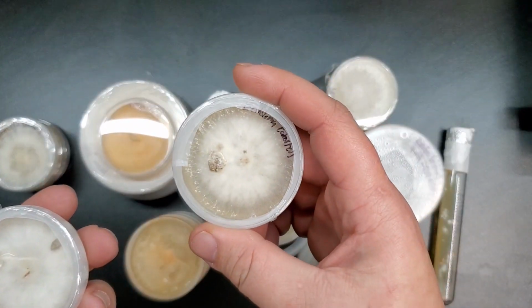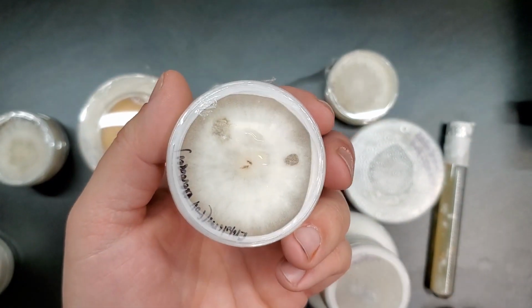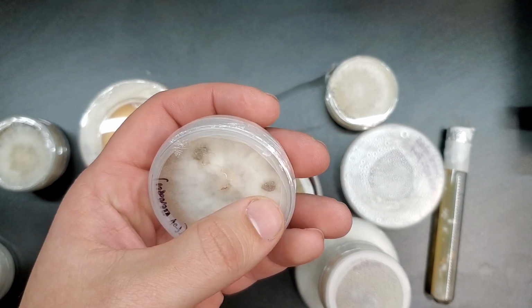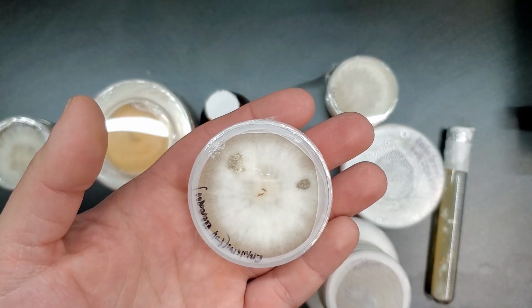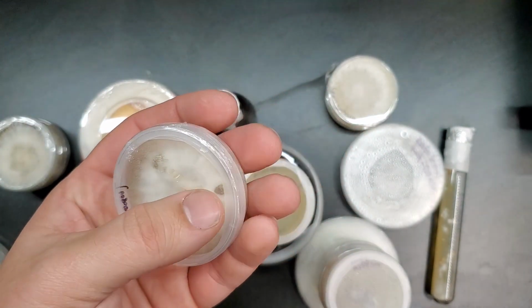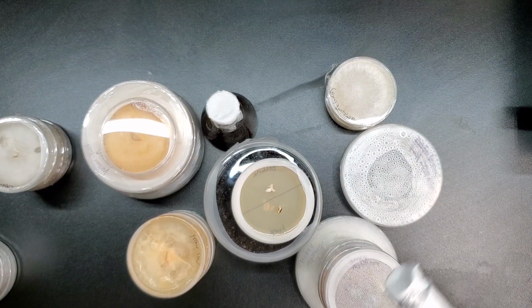This one right here doesn't surprise me too much to see these odd areas of growth because this is from the aborted form. But this is from a fully formed Entoloma specimen. So does that mean that it's actually fairly common for this species to just put off these aborted mycelial masses? Or am I missing something here? Because like I said, there's no honey mushrooms in here for them to interact with, yet they still seem to be very, very apt at putting off these aborted nodules of mycelial growth. Very strange.